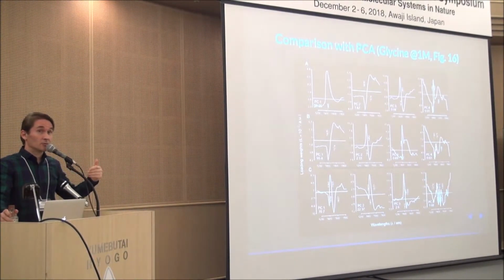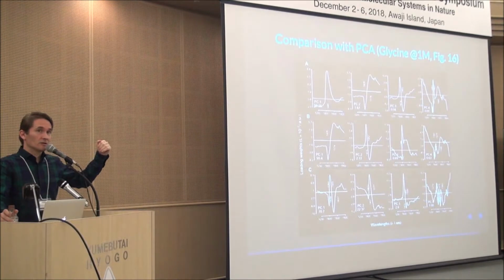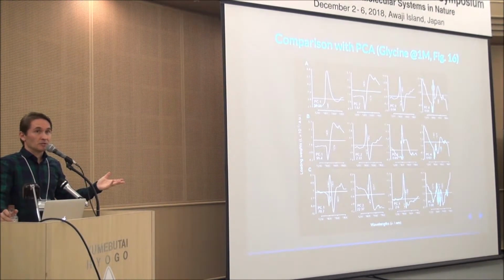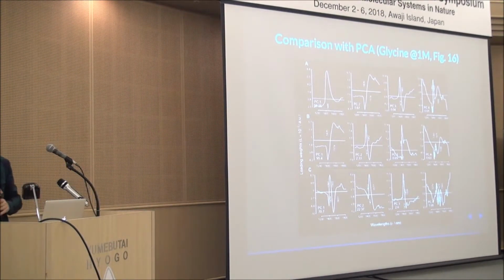Can we take a little more work? So my idea currently is to take even less spectra, maybe just take spectra at each degree, or 2 or 5 or 10 degrees. The bigger the gap, the better, and then use linear combinations. That would be the best. Or some kind of model to even predict. You would extrapolate between the temperature steps? Yes.